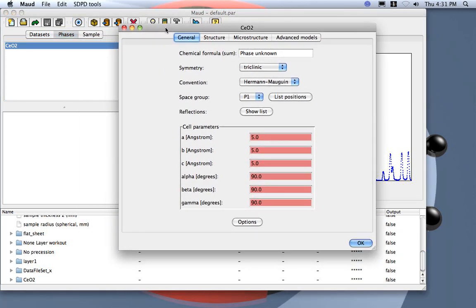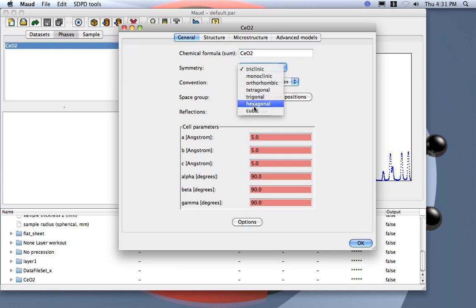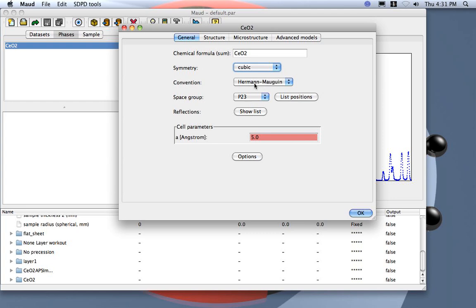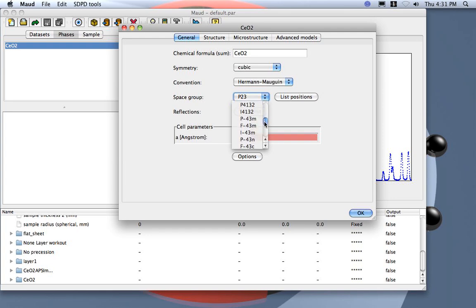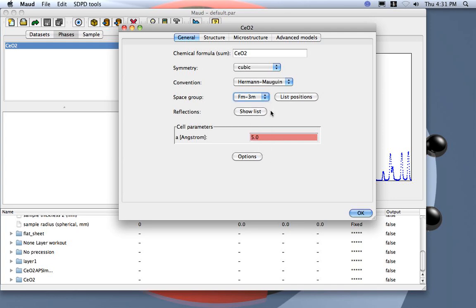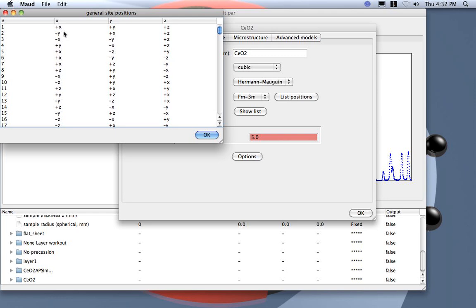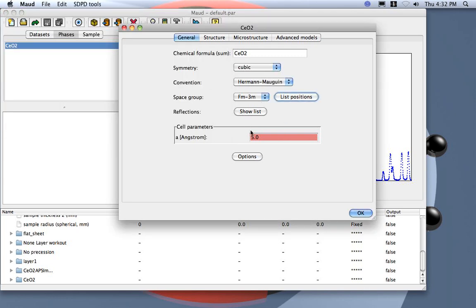Here you normally put the chemical formula and the name. This is cubic — you enter the space group. I advise using the Hermann–Mauguin convention, and the space group should be FM3M. You can also check the list of atomic positions if you are not sure, and compute the list of reflections.